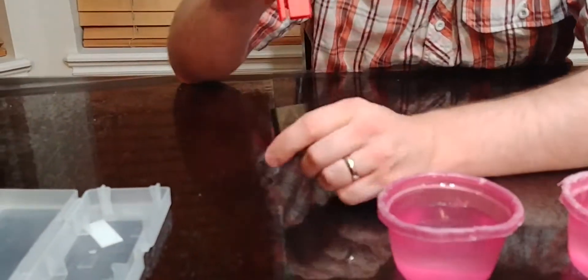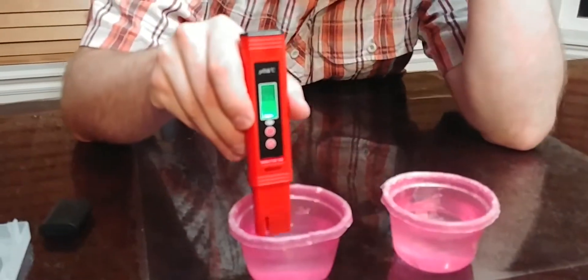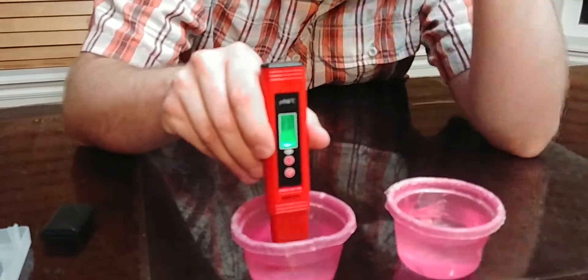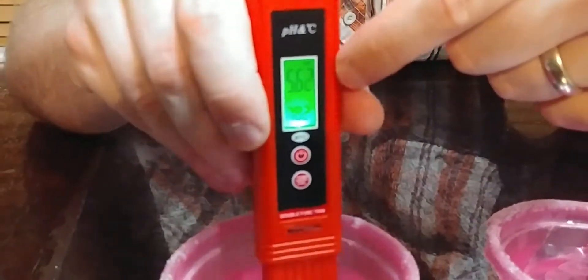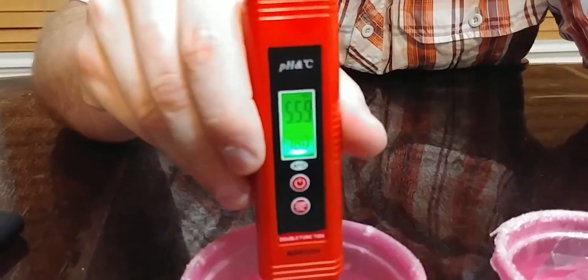And this is all you do — take the pen cap off and put it in the liquid. This one's the water, so you just put it in there like you're doing your fish tank or whatever and stir it around a little bit. You're going to get a temperature reading on the bottom and the pH level on the top. It should be about 5.6 for regular water — and we're at 5.6, so that's pretty good.